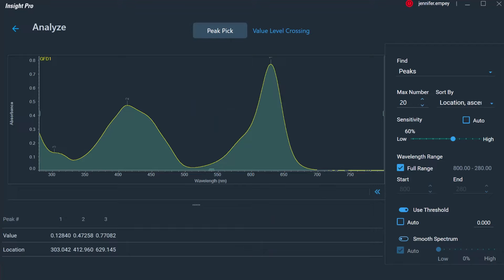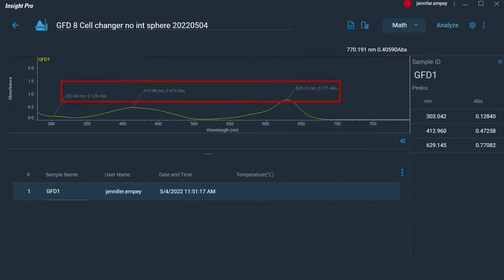Insight Pro can also be used to automatically find the maxima and minima of a measured absorption spectrum, allowing for a quick determination of the location of absorption features specific to the measured sample. The resulting peak maxima and minima locations can then be included in the reported graph.